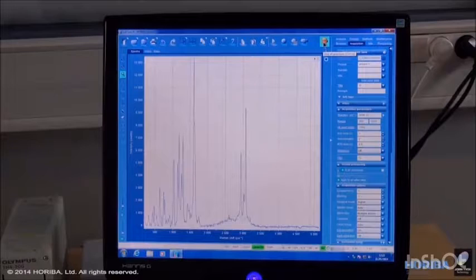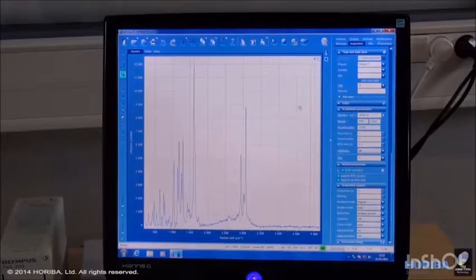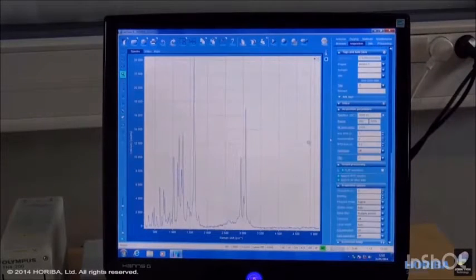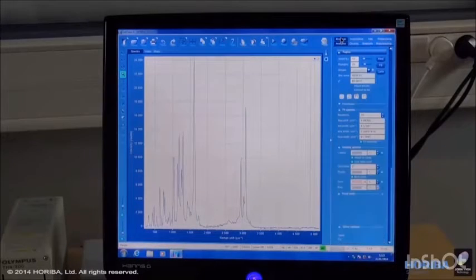I will stop now the real-time detection and I will launch a Raman spectrum acquisition for 1 second. Two accumulations will be used for a better signal-to-noise ratio. This is the Raman spectrum of the aspirin easily obtained in one shot, with a good signal-to-noise ratio, as you can see. For the further spectral analysis, we can follow, for example, the band maxima.